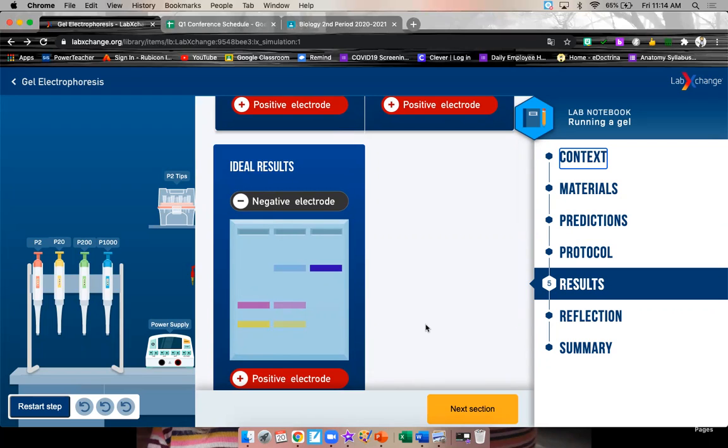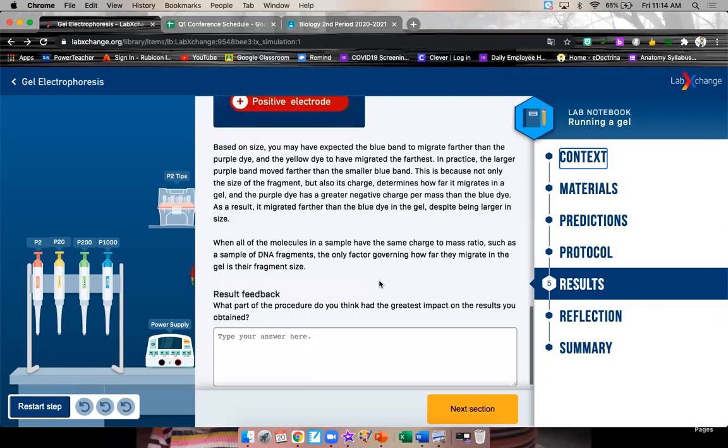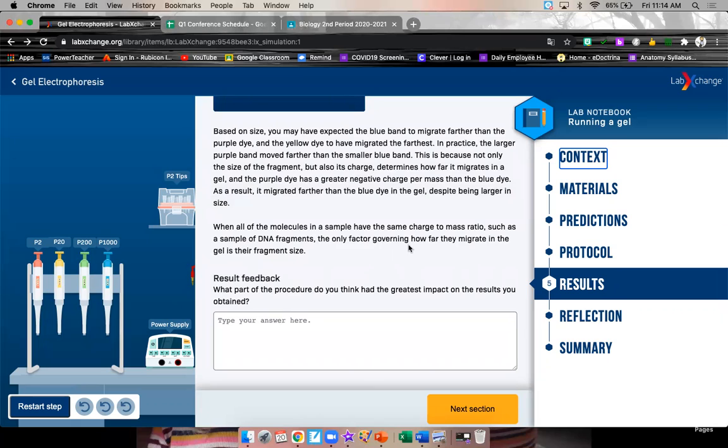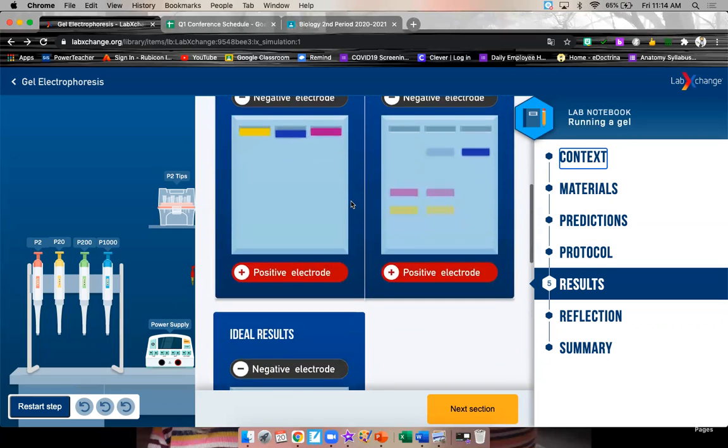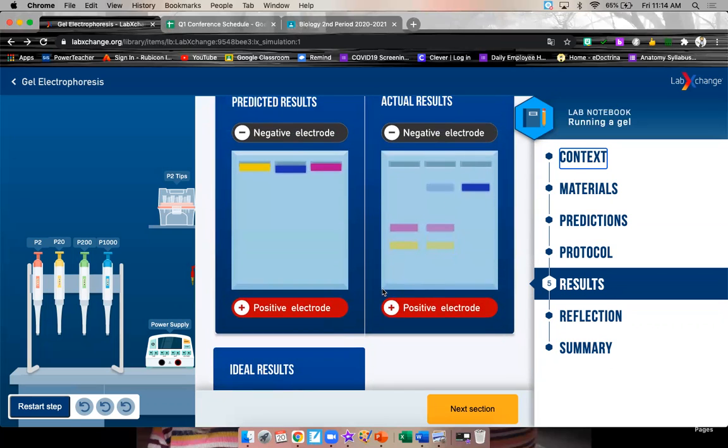Normally, everything would have the same charge. So, it would be the size that matters. All right, at this point, we are going to stop using this website. You're going to go back to Google Classroom, and there is a Google Form waiting for you to answer questions. You can keep this picture up for comparison, but you will not be clicking on anything else. Good luck on the Google Form, and let me know if you have any questions.